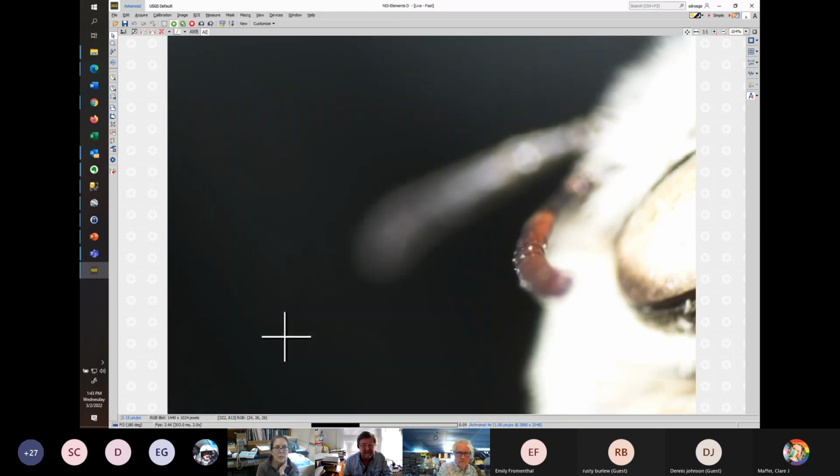Right. Oh, there's the orange. I don't see Niveus often. Yeah, there's the orange. If you could just angle it a little bit to see F2 there.